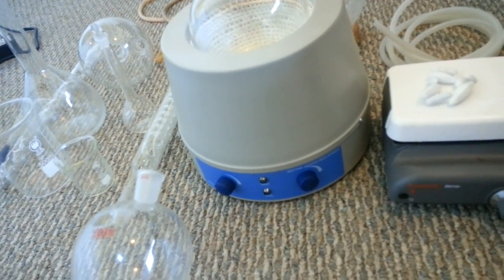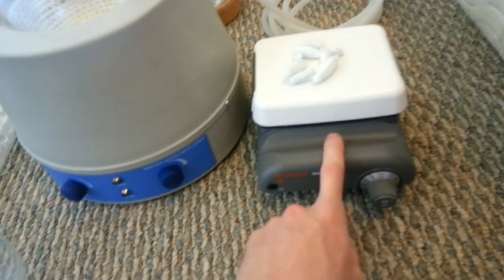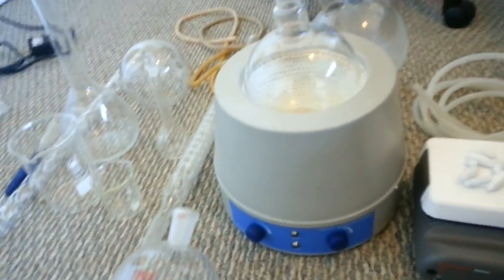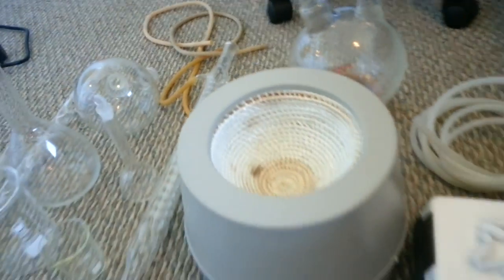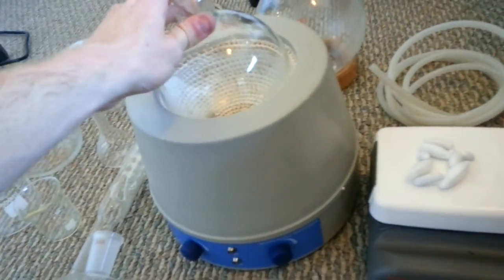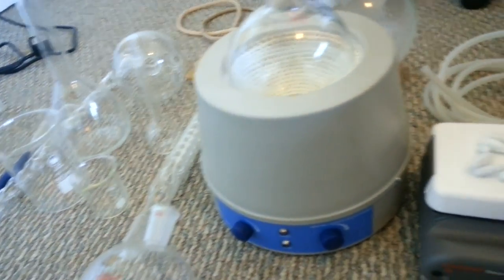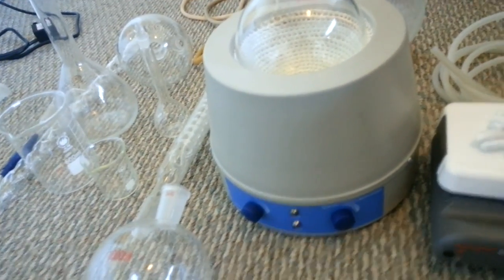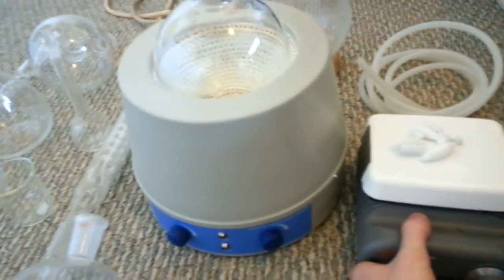You'd also want to get a hot plate — one that looks just like this except instead of just a stirrer, it's also a hot plate. Or even better, get a heating mantle with a stirrer inside of it. What it does is it heats the round bottom flask from this mesh and heats it really, really well. It's very insulated and effective at boiling stuff, and it also has a magnetic stirrer so you can put one of the stir bars in the flask and it'll stir and heat at the same time. This was about $200 — kind of expensive, but in my opinion, worth it. Don't skimp on that.